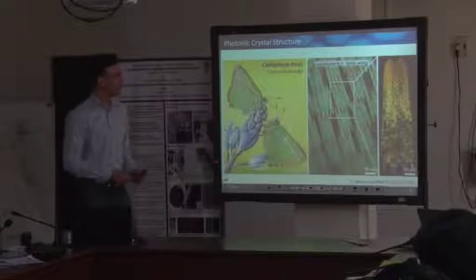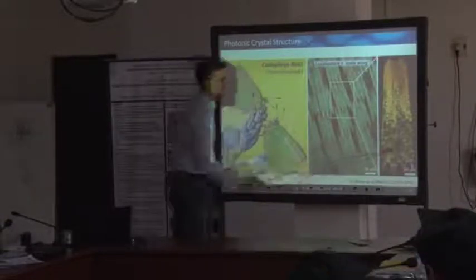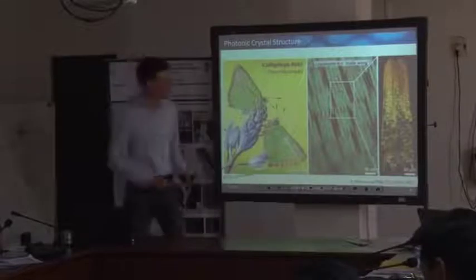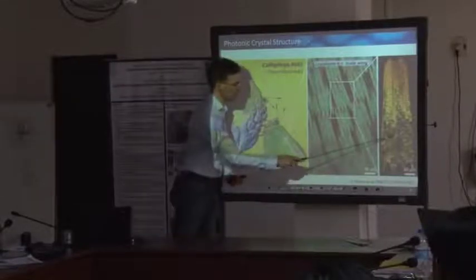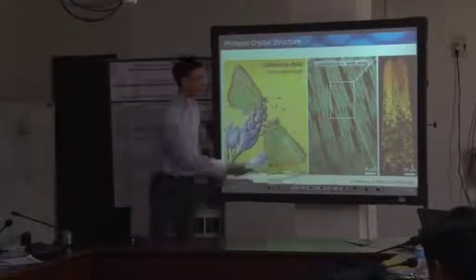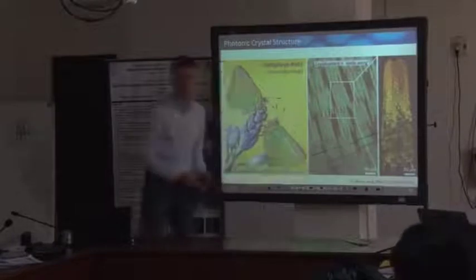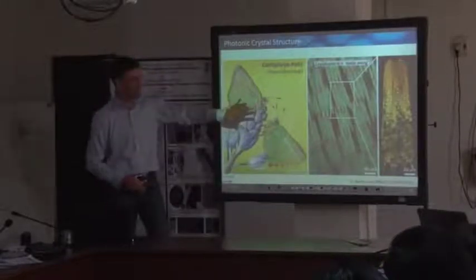This is how an individual wing scale looks under the light microscope. You see that some of these individual areas appear green, others don't show any color. The reason is that there are crystallites there as well, but they are misaligned with respect to the incoming light.